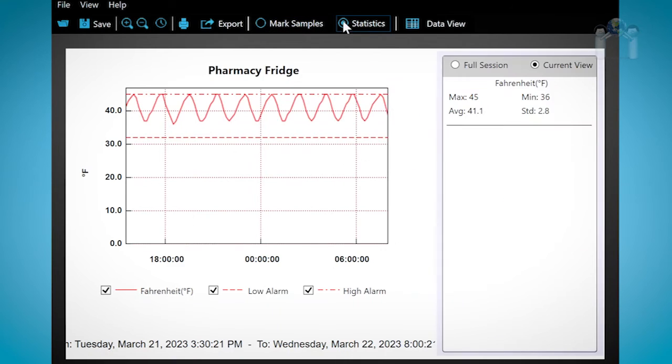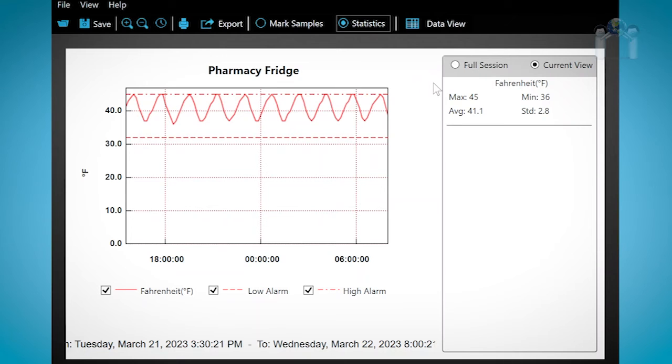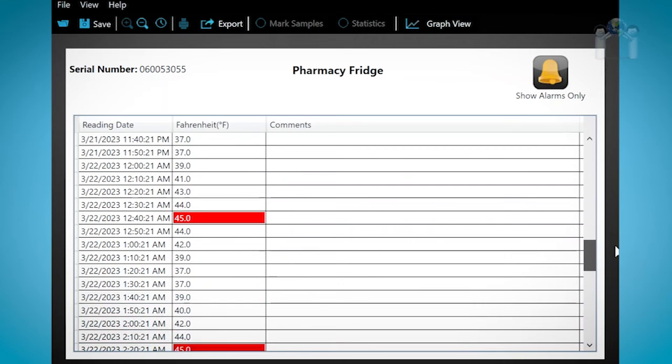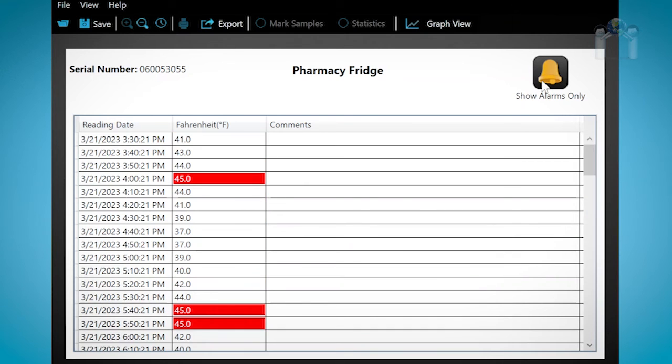Click on Statistics and a window will appear on the right. The current view will show you the details of the area of the graph that is selected. Since the entire reading is displayed, you will see the general statistics from start to finish. If you have selected a range, the details of only that area will appear. Click on Data View and you will see the data in text view instead of a graph — this is an easy way to scan the recorded temperatures. Some temperature readings are in red, indicating a high reading, and some are in blue, indicating a low temperature reading. You can click on the icon Show Alarms Only in the upper right corner to view only the alarm readings. Click on it again and the non-alarm readings will return. You may also notice the data logger serial number appears on this screen. To return to the graph, click on Graph View.